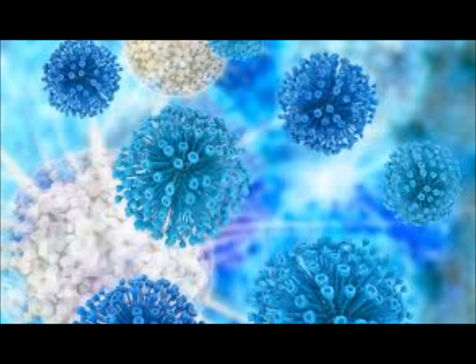What do you think you as a tech have to do to support good aseptic technique when you're looking at plates? Do you just open them up and leave them open to the air, just sitting there the whole time until everybody comes and looks? You don't want to keep plates open to the environment to have something come from the environment on it. So when you're doing anything, streaking, you don't want to set your loops out on the table and have 10 loops out sitting on your table and then use them for your plates. They should stay in the holder.